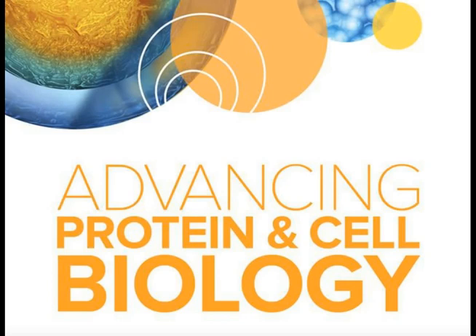So the custom module does let you measure positional information, X, Y, and Z position. There is a measurement for each object that is the distance to its nearest neighbor. So that gives you dispersion measurements. And then there's also a 3D distance map measurement. So you can have the distance of one object from some common source or from something in a different channel or a different type of object.